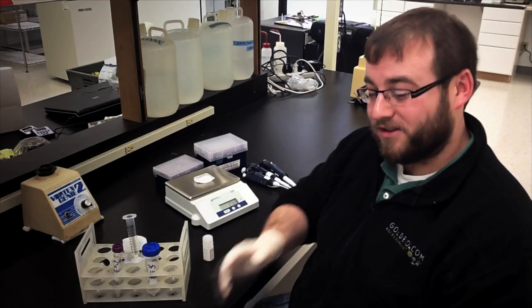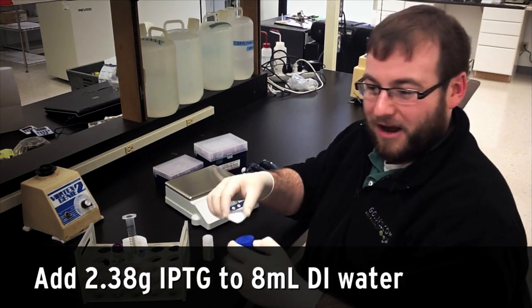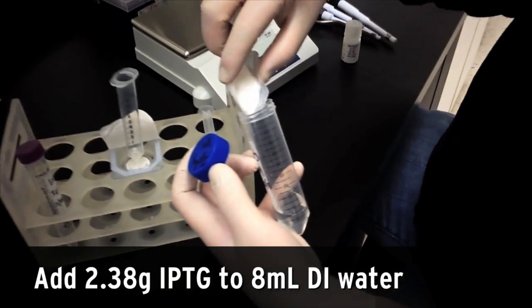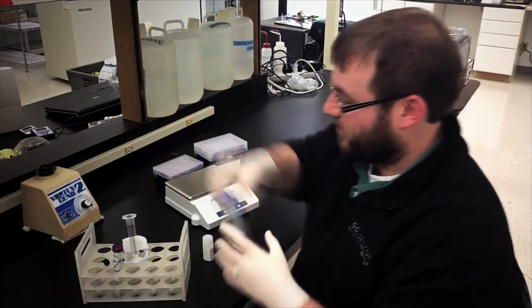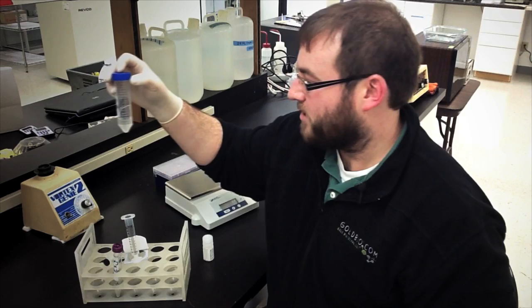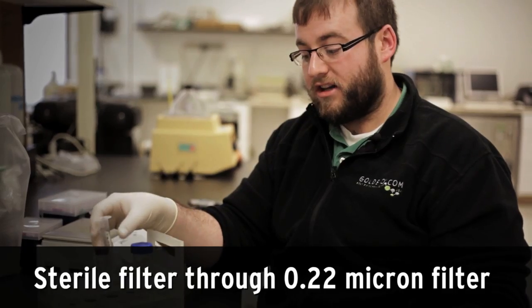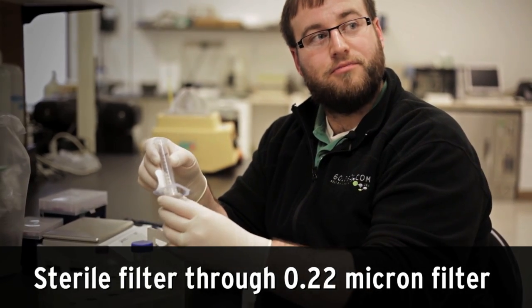Since creating the stock solution isn't exactly what we'd call super crazy brain meltingly exciting TV, we'll just go over it quickly. First you'll simply add 2.38 grams of IPTG to around 8 milliliters of DI water for a 10 milliliter solution. Mix until dissolved, then top off with additional DI water if necessary. After everything's in solution you'll want to sterile filter through a 0.22 micron filter.